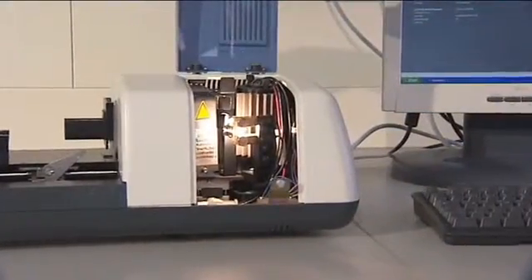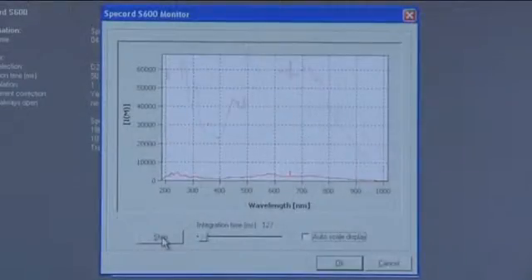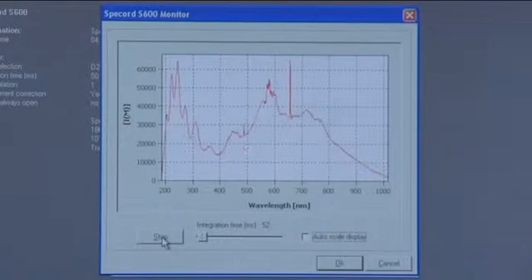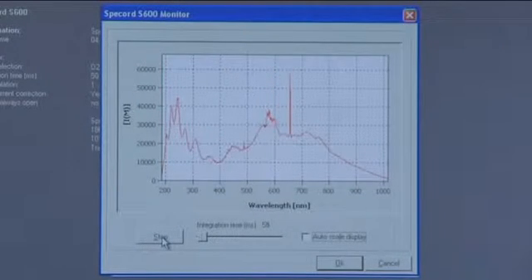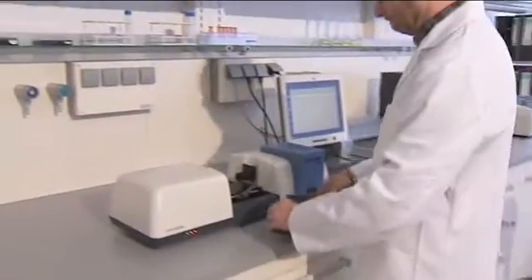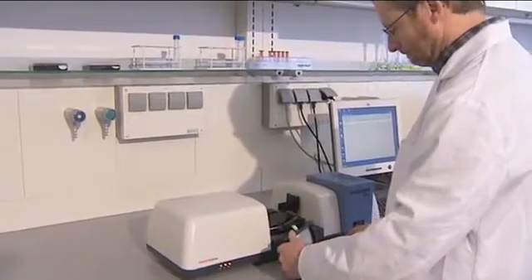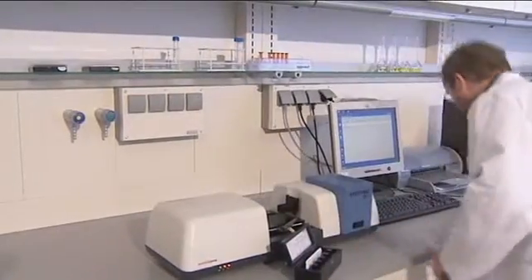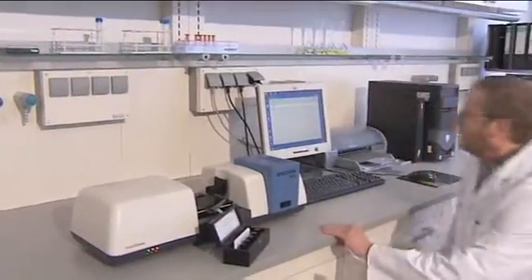Light sources are easily accessible and interchangeable. The combination of deuterium and halogen lamp ensures a high light yield through the complete spectral range of UV to NIR. A self-adjusting photometric linearity and an automatic stray light correction are additional advantages of the Spicord S600.